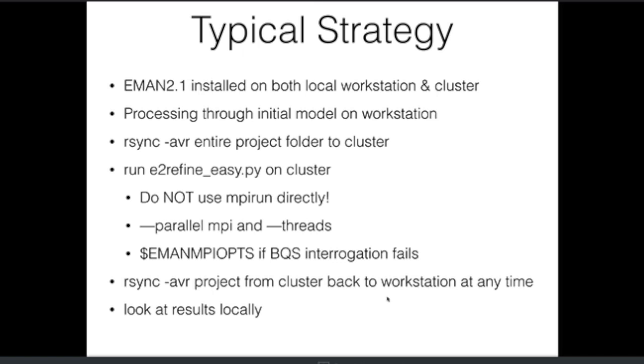Since we're using rsync, it only copies files that have changed during the refinement procedure, both going from the cluster and back to the cluster again. So you can basically keep your folders in sync back and forth. And again, that way you have a backup and you know what's going on. So that's the typical way you go through a project.